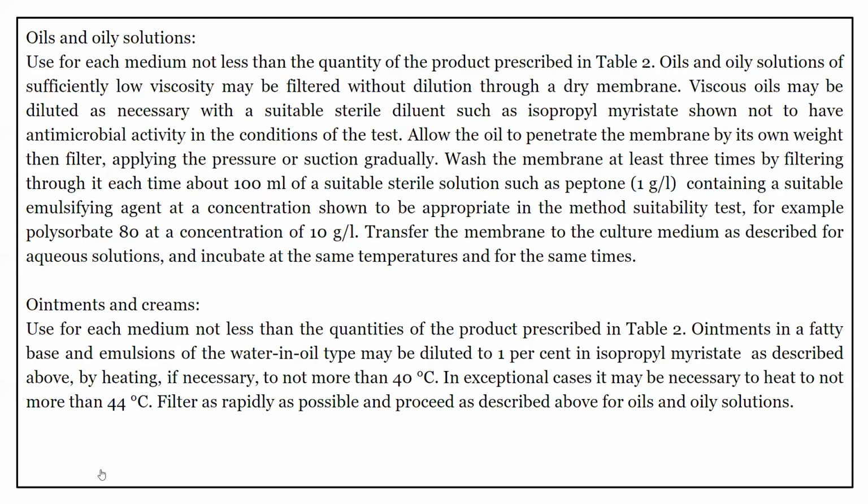Then allow the filter to wait, and then the formulations will be filtered by applying positive or negative pressure. Once the filtration is over, washing of the membrane filter paper is necessary with an emulsifying agent so that all oily traces get washed away, and then the medium is incubated in the two separate cultures. Okay. So that is the procedure for oils and oily solutions, ointments and creams.